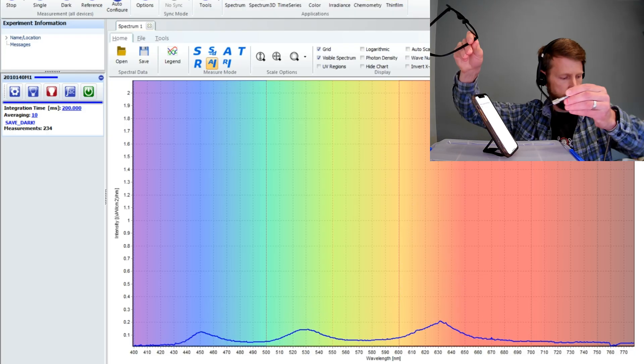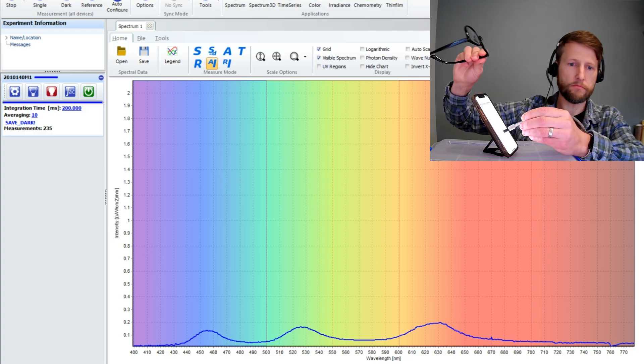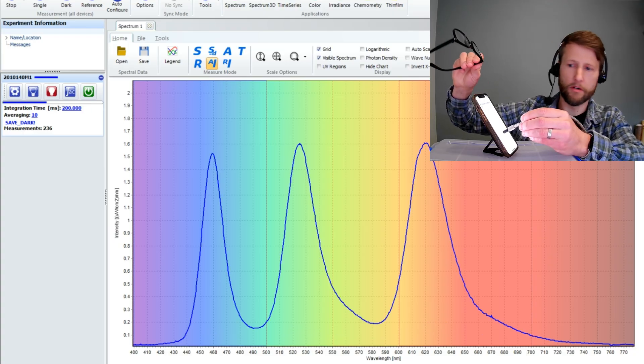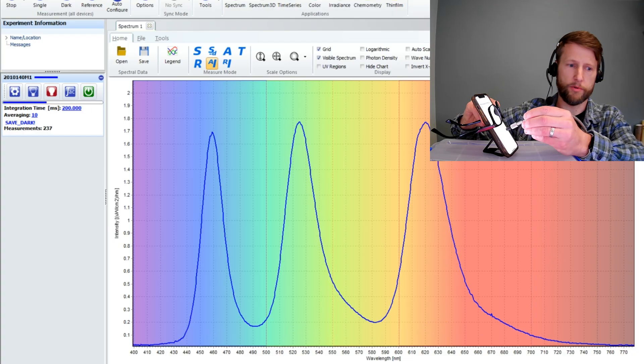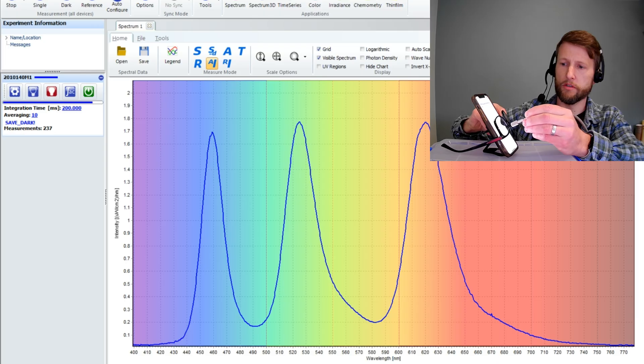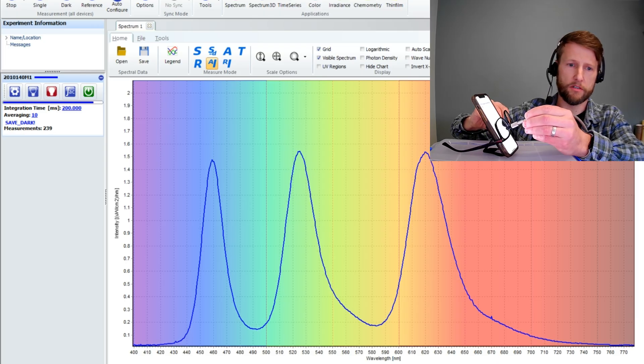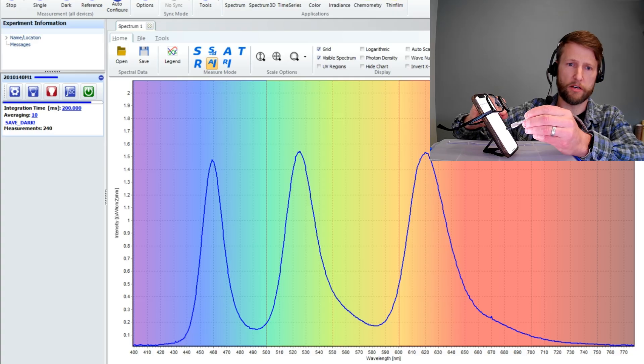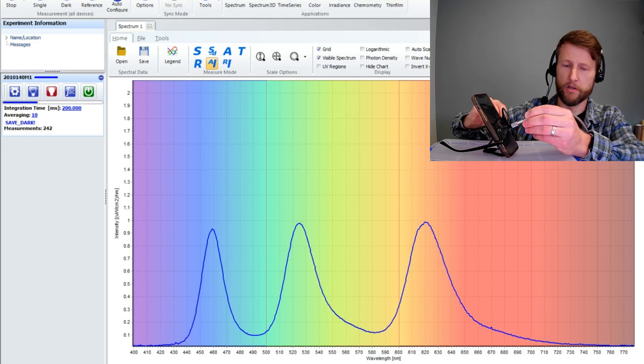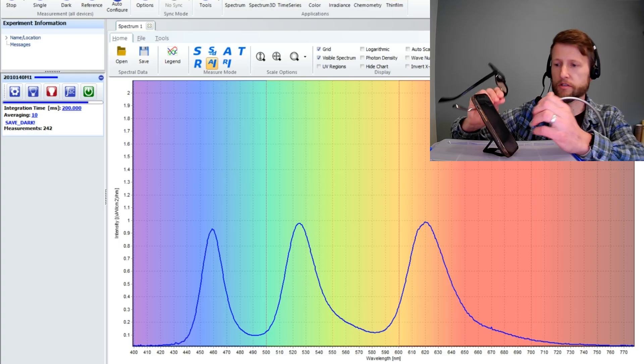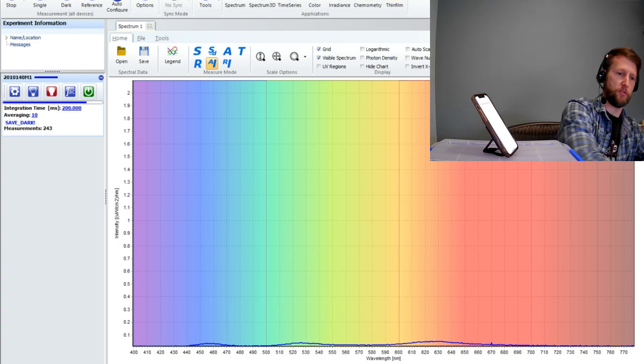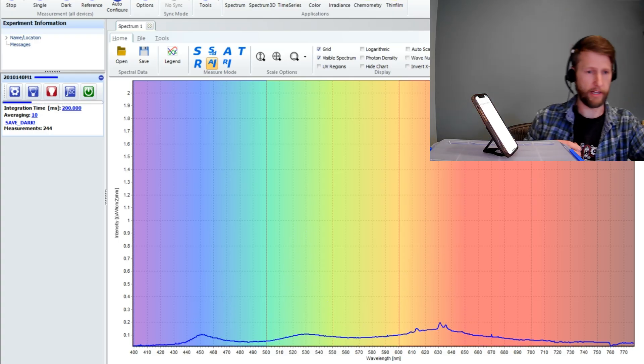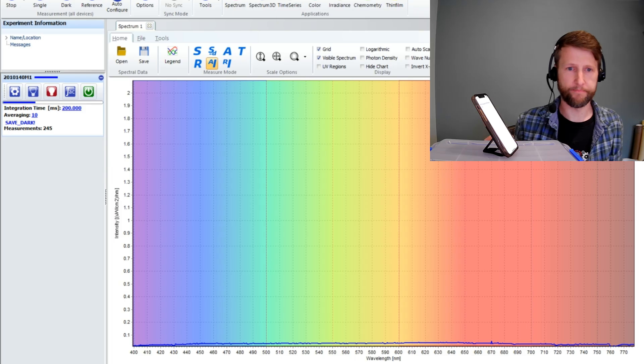And then finally, the clear ones. Once we put those in between the spectrometer and the phone, nothing happens. Barely goes down ever so slightly, but really no considerable change in the spectrum. When you use the clear glasses, I'm not very surprised by that.